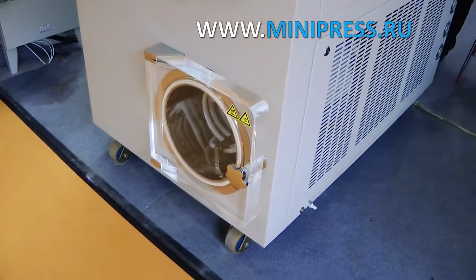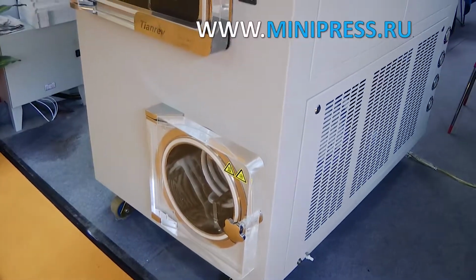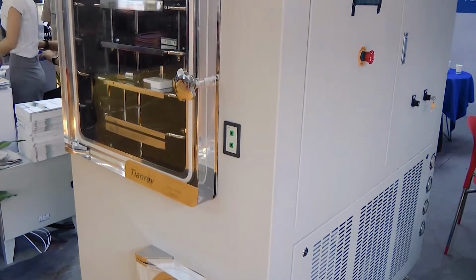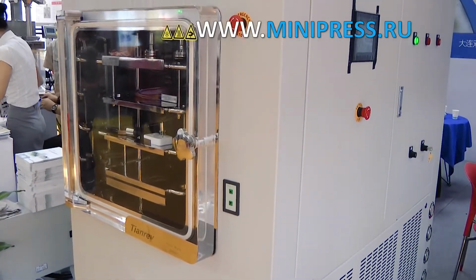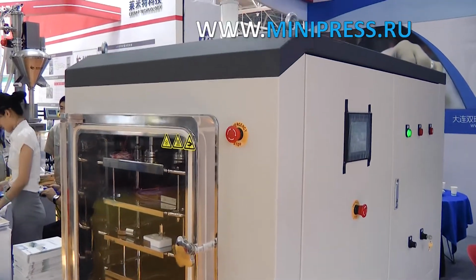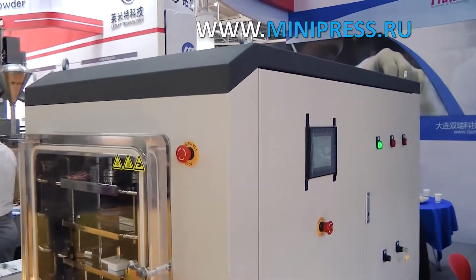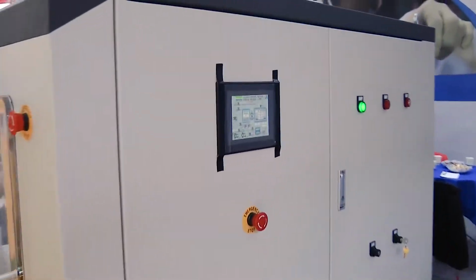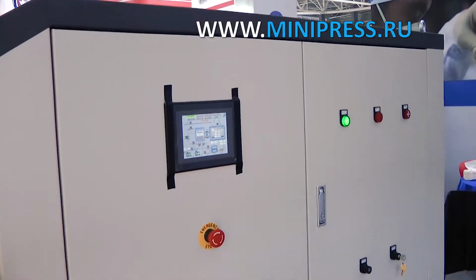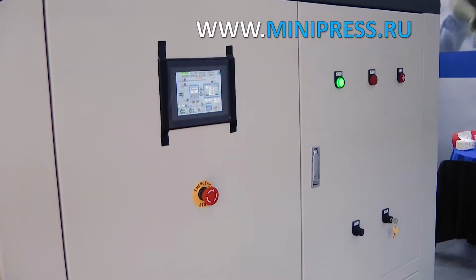I, as chief technologist of the enterprise, was instructed to find and purchase a dryer within a month, as it was planned to supply new raw materials. The laboratory engineer specified that a vacuum freeze dryer was needed. Freeze drying is used to dehydrate and dry food, pharmaceutical and biological products. Moisture in a vacuum is condensed and frozen. Vacuum drying allows product rehydration and recovery by adding water.